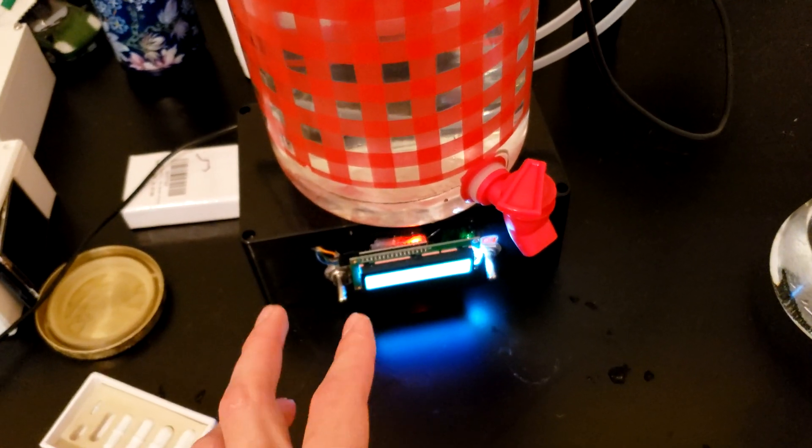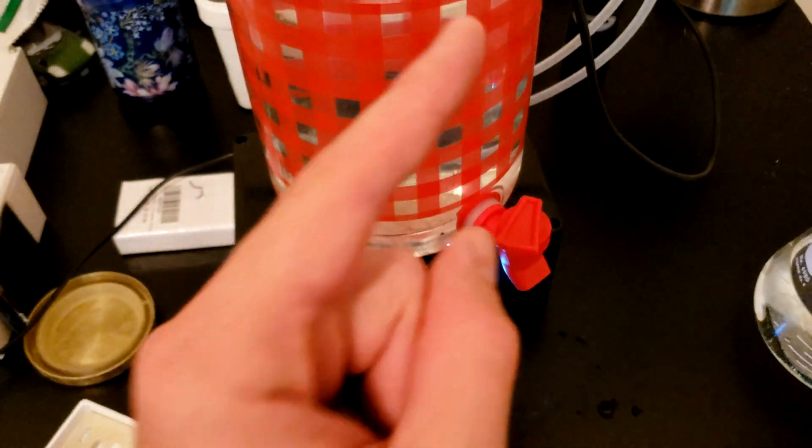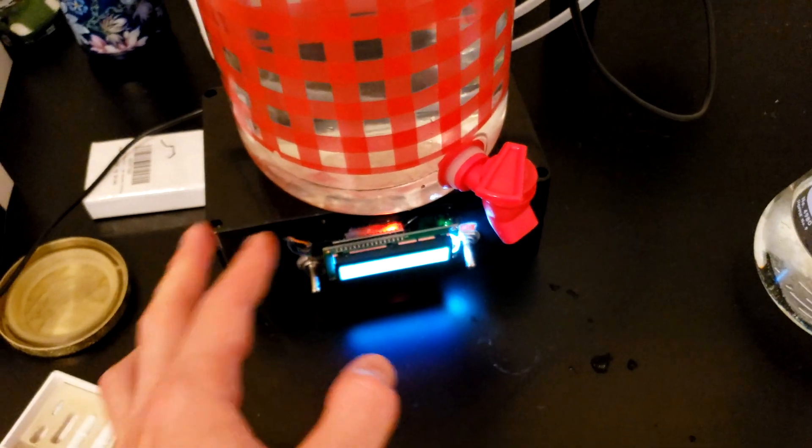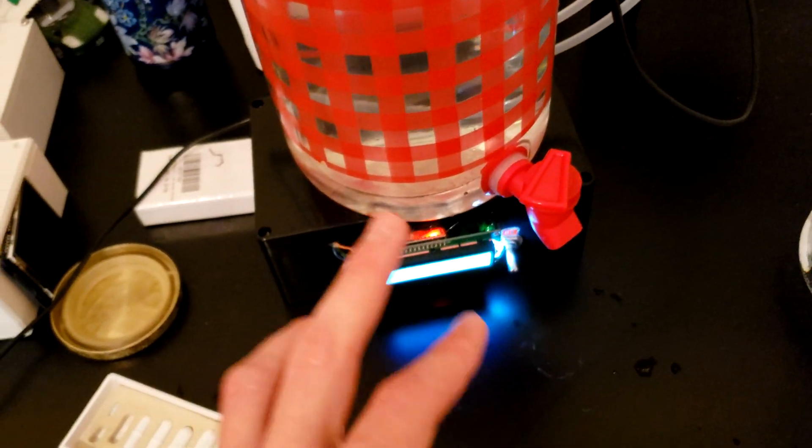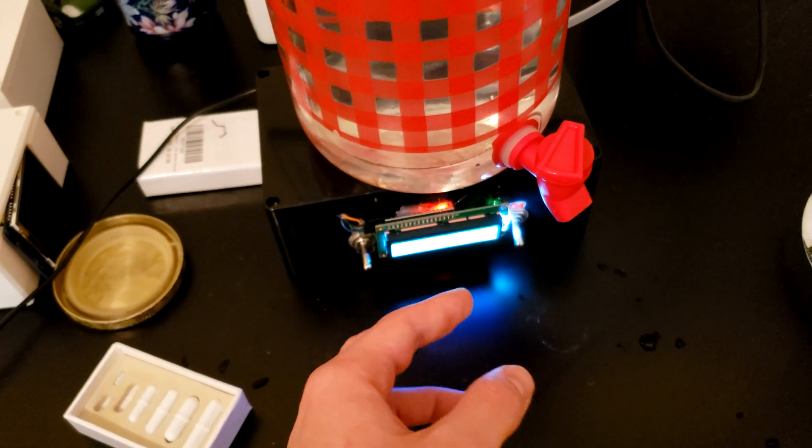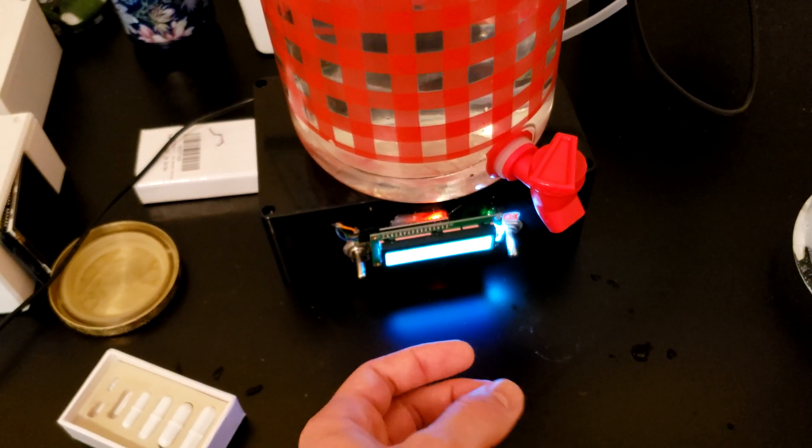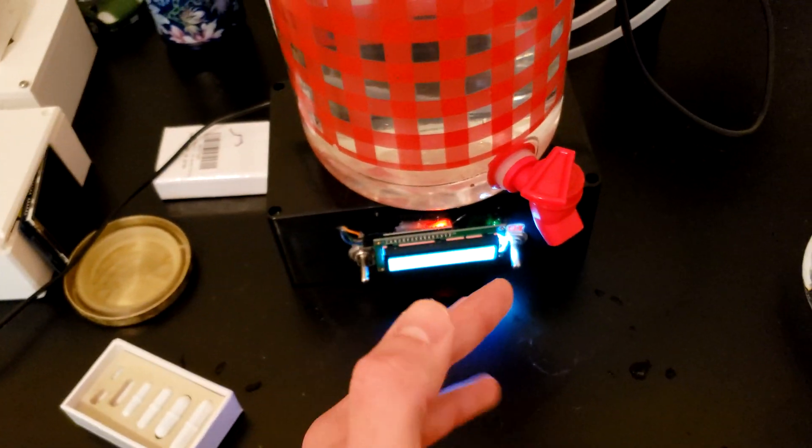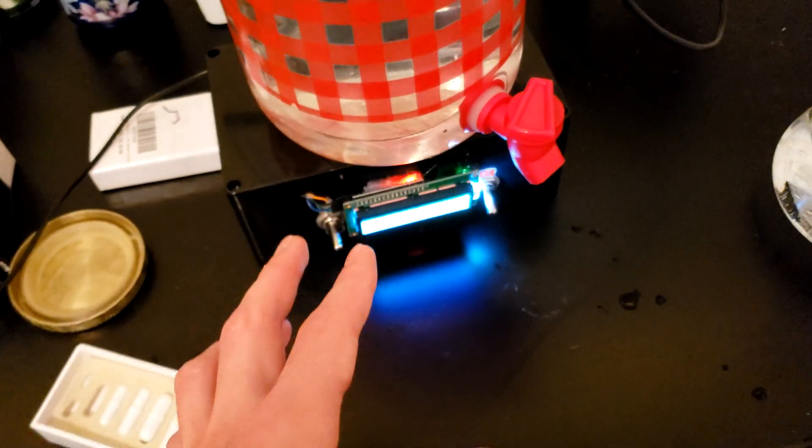I just wanted to talk about some of the things that went wrong with the stir plate. There were a lot of issues. The original video that I made was kind of crap because I used potentiometers instead of rheostats. If you're going to make a stir plate yourself, use rheostats. Don't use potentiometers because they don't work.